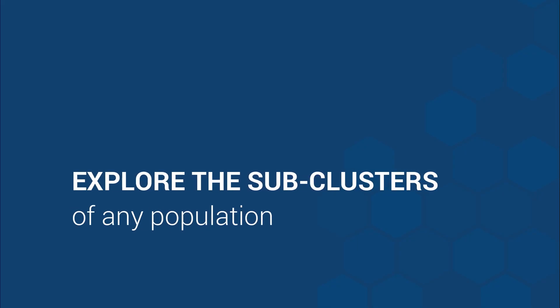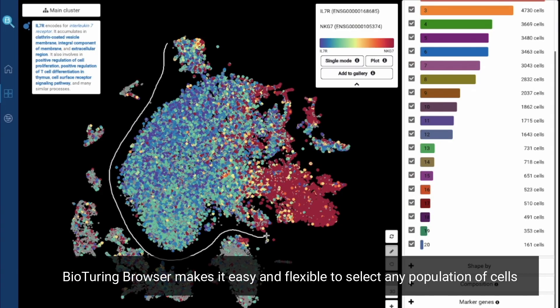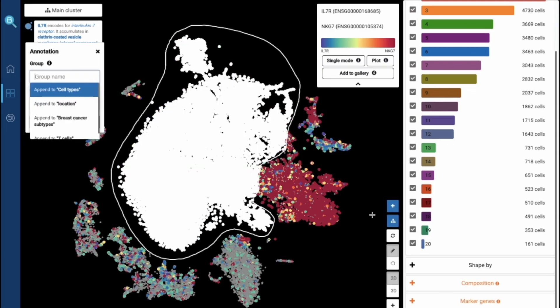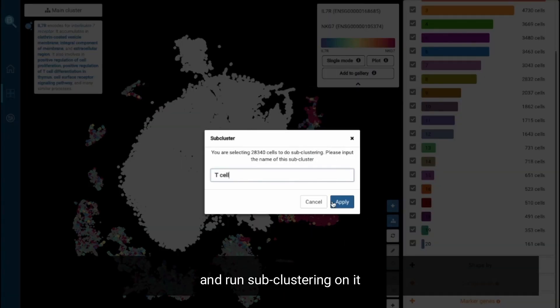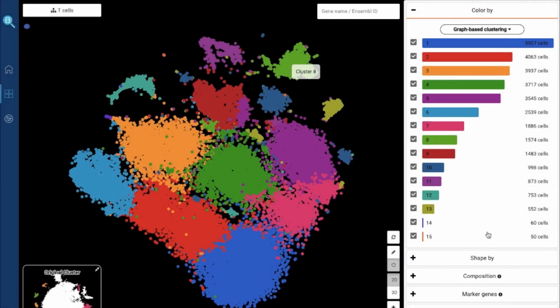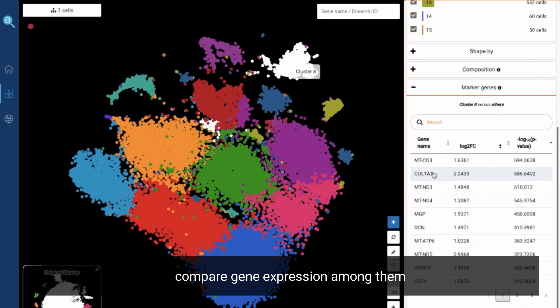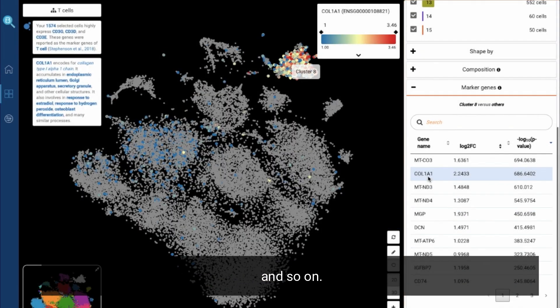Explore the sub-clusters. BioTuring Browser makes it easy and flexible to select any population of cells and run sub-clustering on it. Here, you can find markers for the sub-clusters, compare gene expression amongst them, and so on.